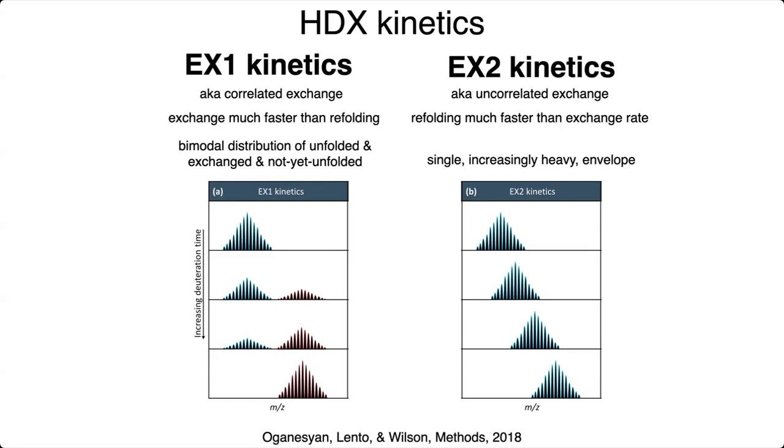It's just little regional breaks in the protein, not breaking actual covalent bonds, but just those hydrogen bonds. If you think about holding someone's hand for a really long time, you might let go real quickly to get a regrip. The same sort of thing happens with your proteins. Hydrogen bonds can be broken and reform, even in regions of a protein that are more solid in the structure. Especially because they're more solid, the things around them are going to stay bonded when they breathe open, and so you will quickly rebind as well. But if during that breathing motion, when you broke the hydrogen bonds, a deuterium stuck in there, well, now you can get that exchanged.